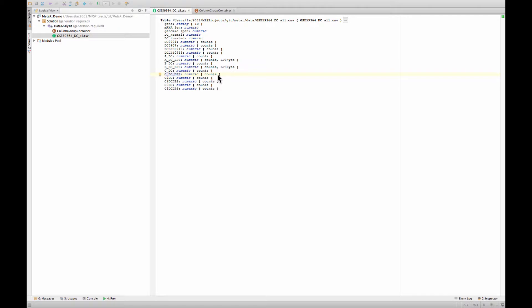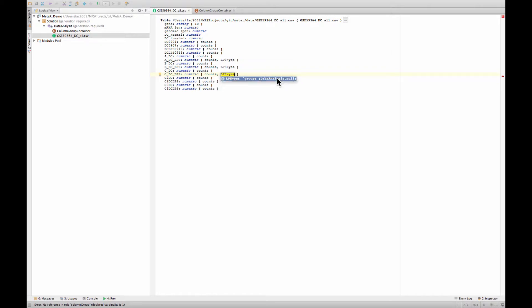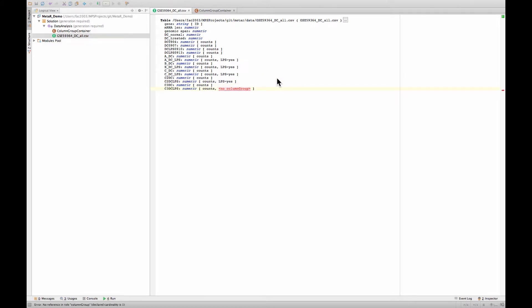So I want to do the same thing here. Or I could just type it. I need to type it right, of course. This is also LPS equals yes. And last one, LPS equals yes, is here.